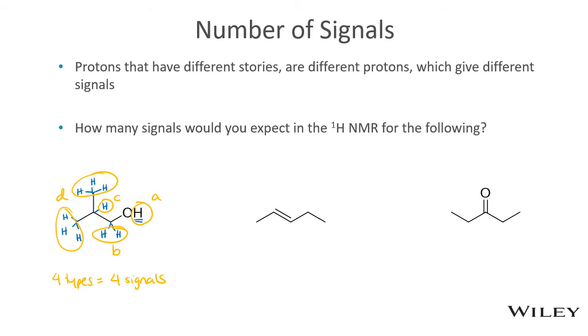Moving on. We have a molecule. We have 3 hydrogens on the end. We have a single hydrogen bound to this carbon of the double bond and another hydrogen to the other side. We have 2 and another set of 3. So we'll start off with these 3 hydrogens.